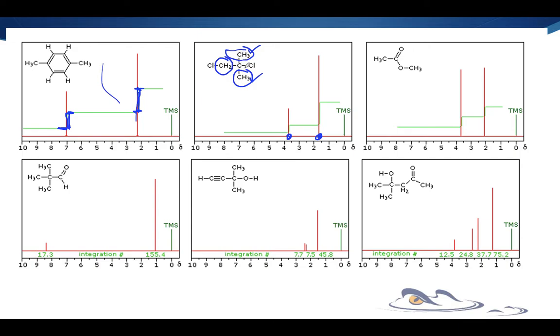And so these 2 CH3 groups are exactly the same environment. So that's why we only see 1 peak for these 6 hydrogens and then 1 peak for this CH2 right here. So notice that this peak is taller, and that's probably these 2, isn't it? It's probably those 2. And then this peak is shorter, and that's probably this.